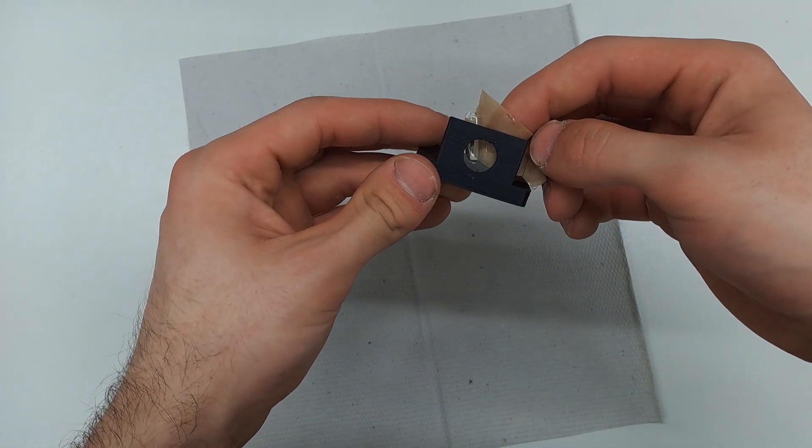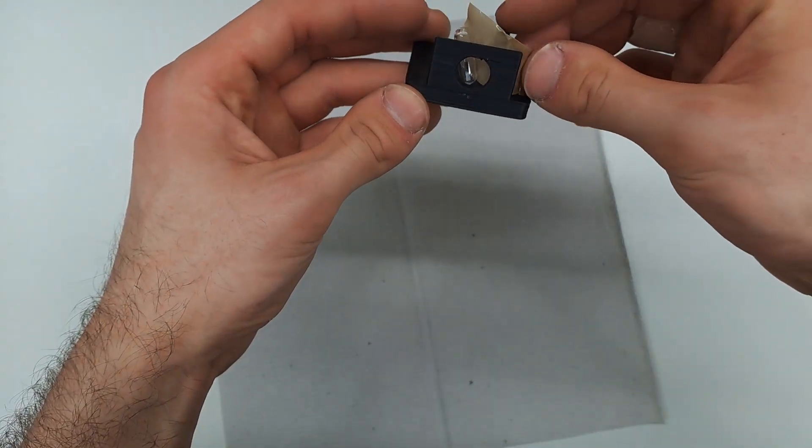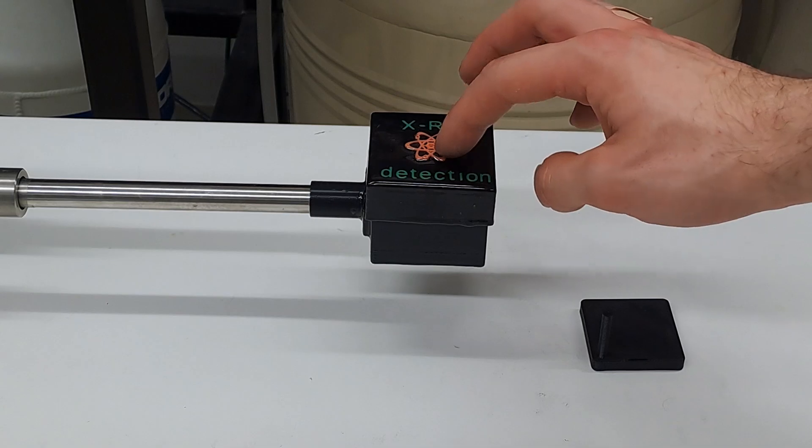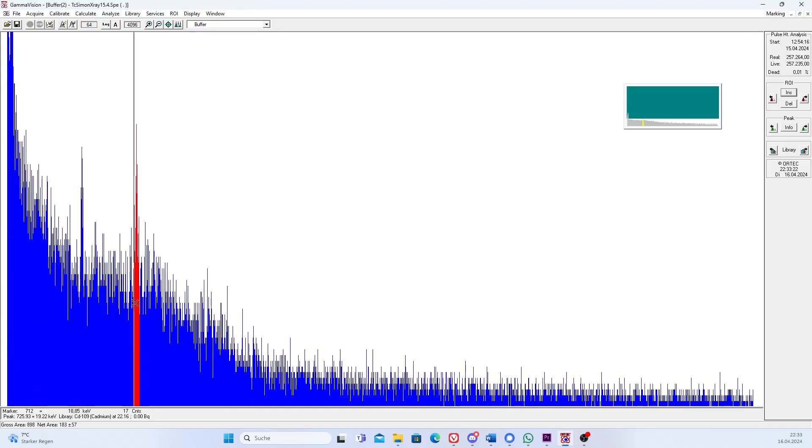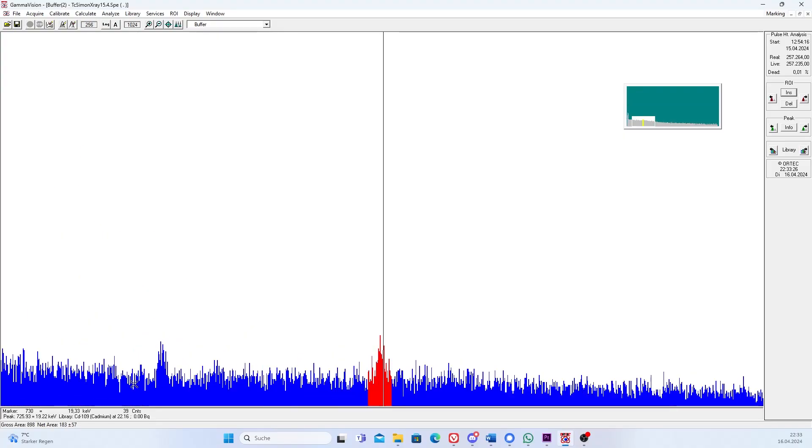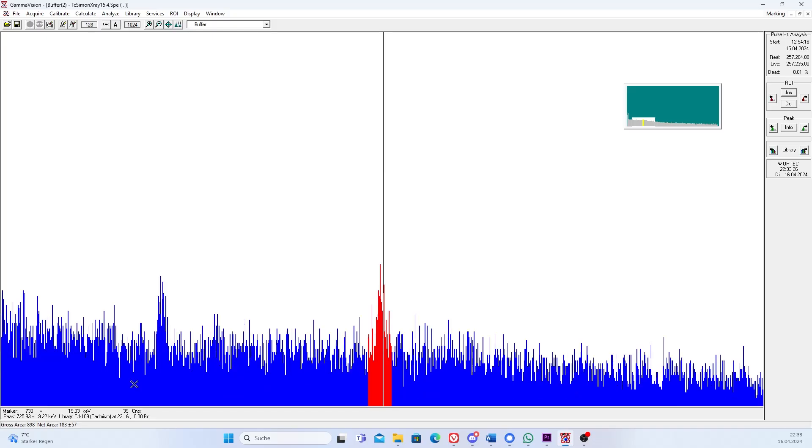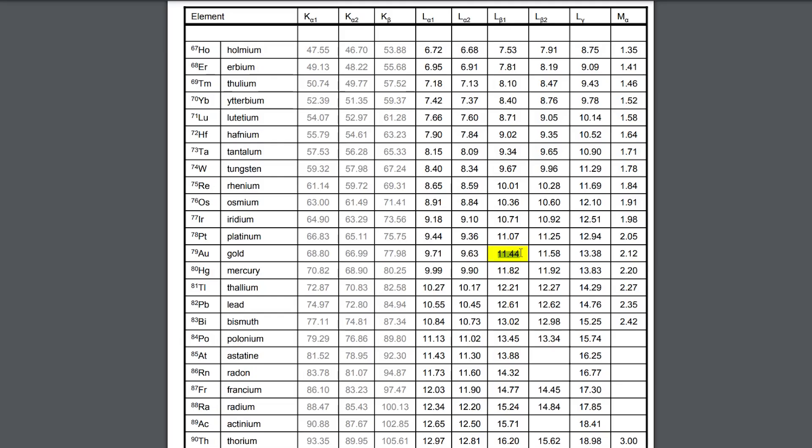I want to see lines that are directly related to technetium. So the X-ray detector has to be used, and after a weekend of non-stop measuring, here it is. A peak at 19 keV. These are ruthenium K-alpha-1 lines. A direct proof of technetium. To preempt the question, the peak at 11 keV is the gold L-beta line. Another proof of gold.